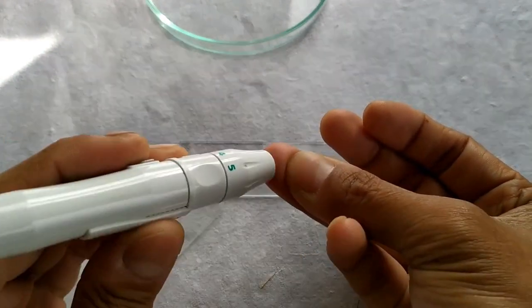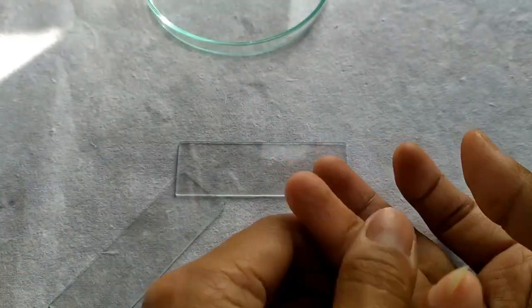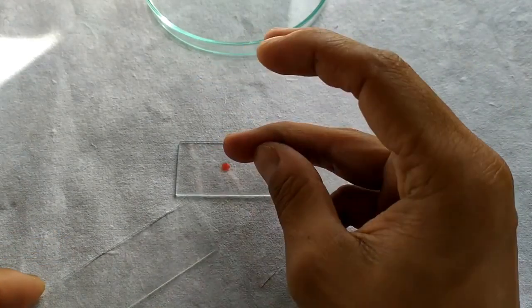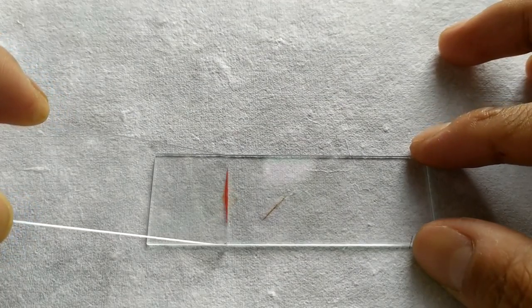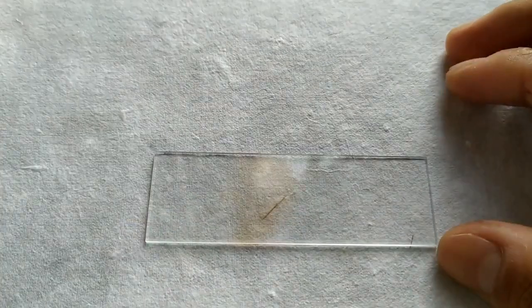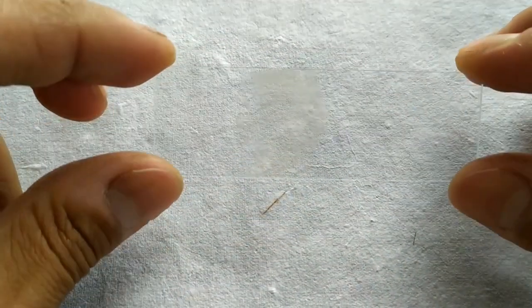In this experiment, we will be covering the procedure on how to prepare a thin blood smear and stain it with an appropriate stain for the morphological and quantitative study of the various cellular elements of blood. For this experiment, we will need the following.